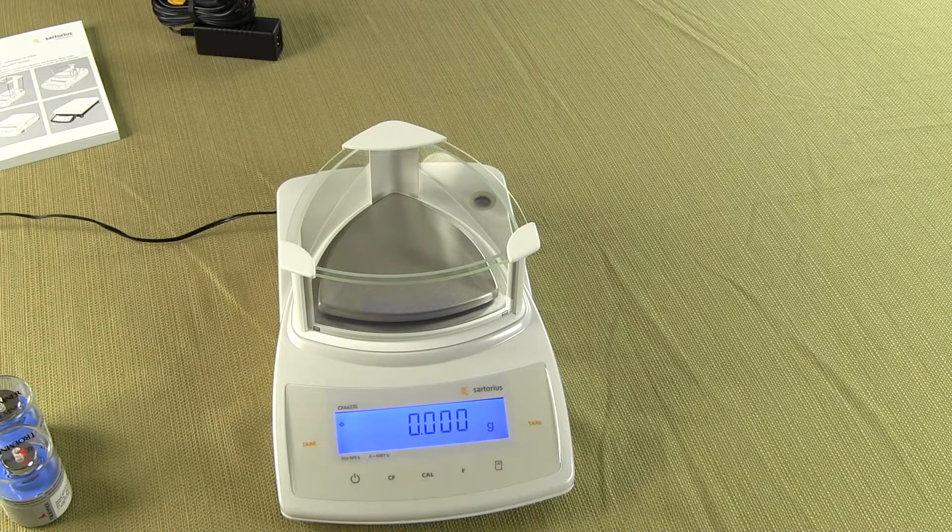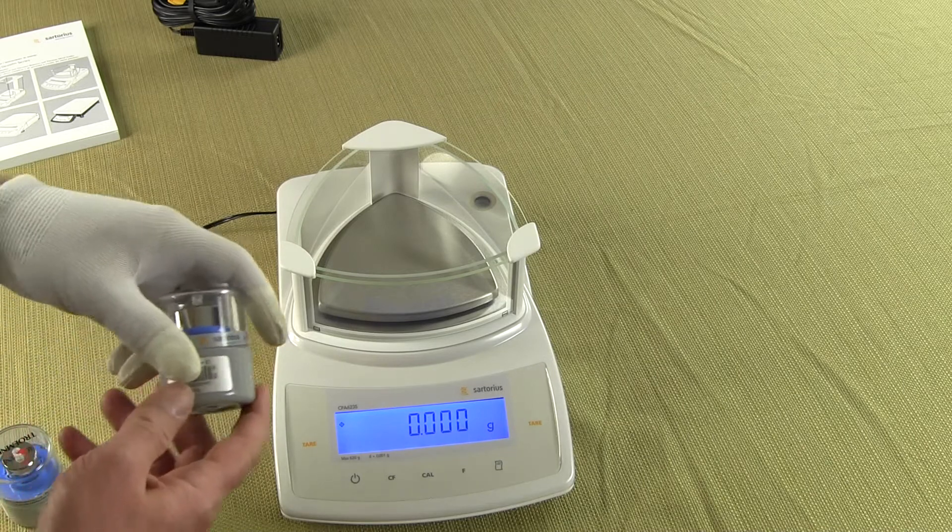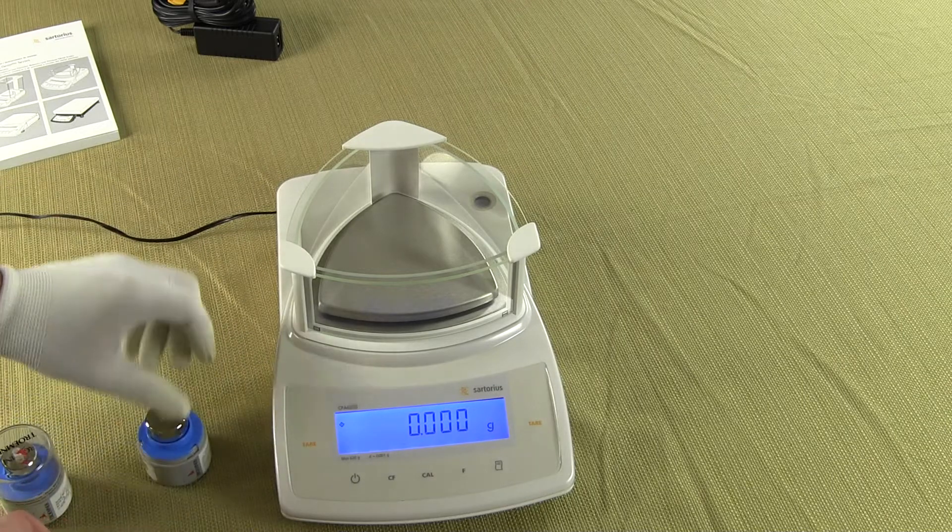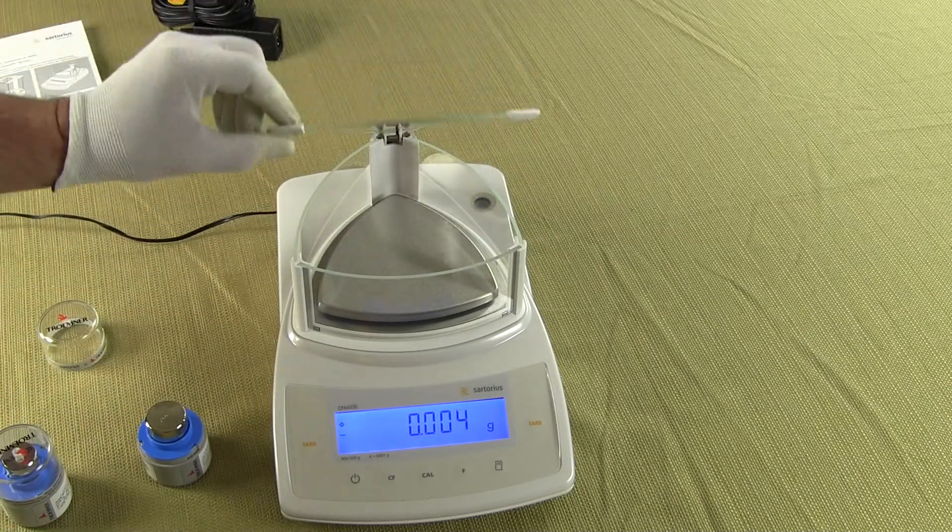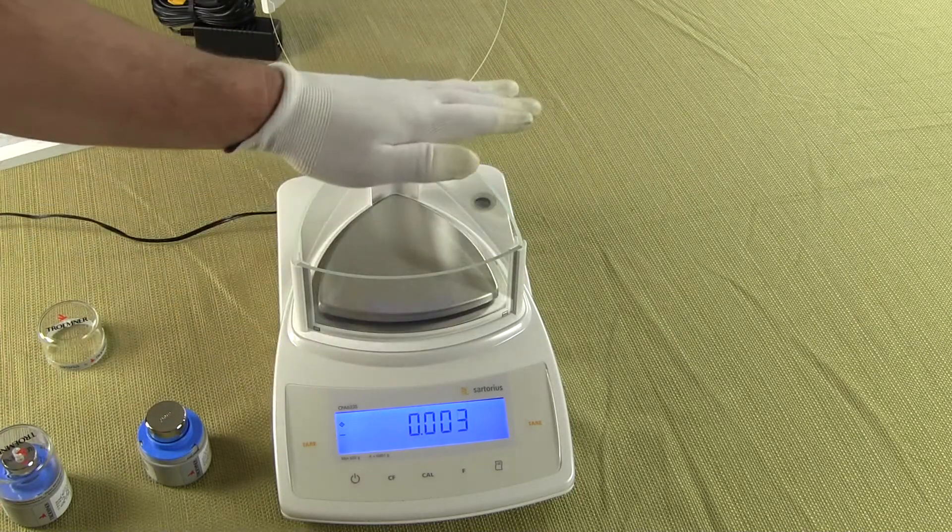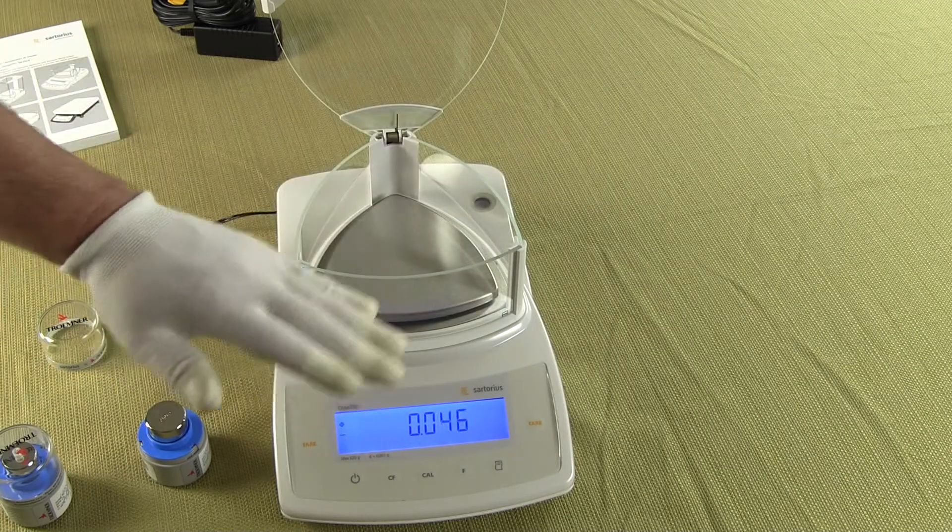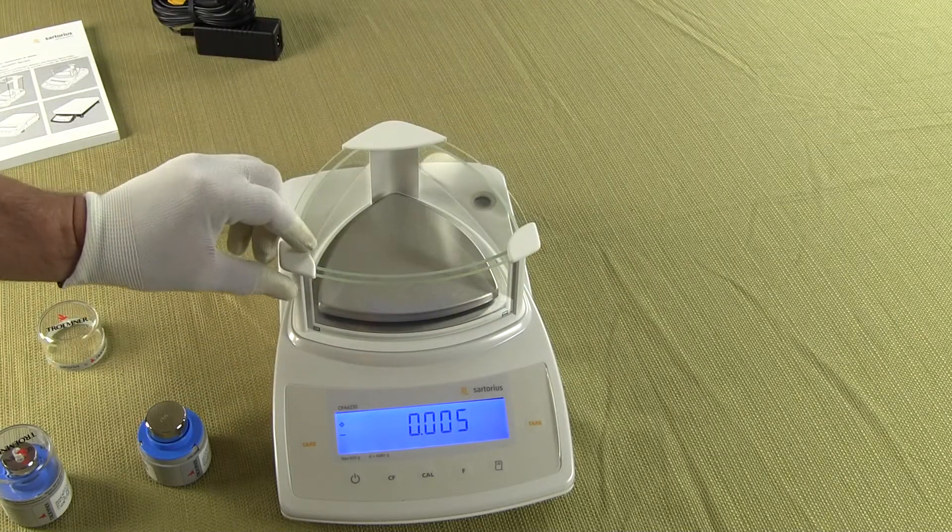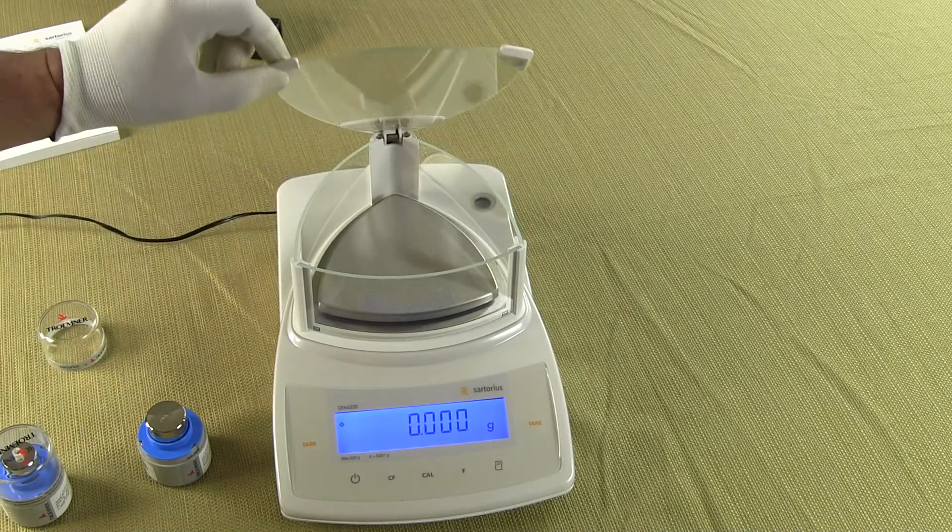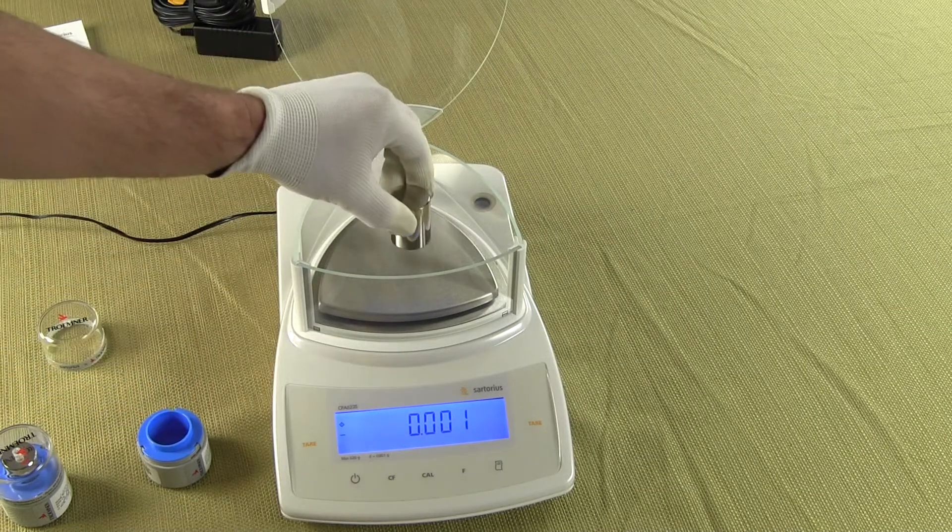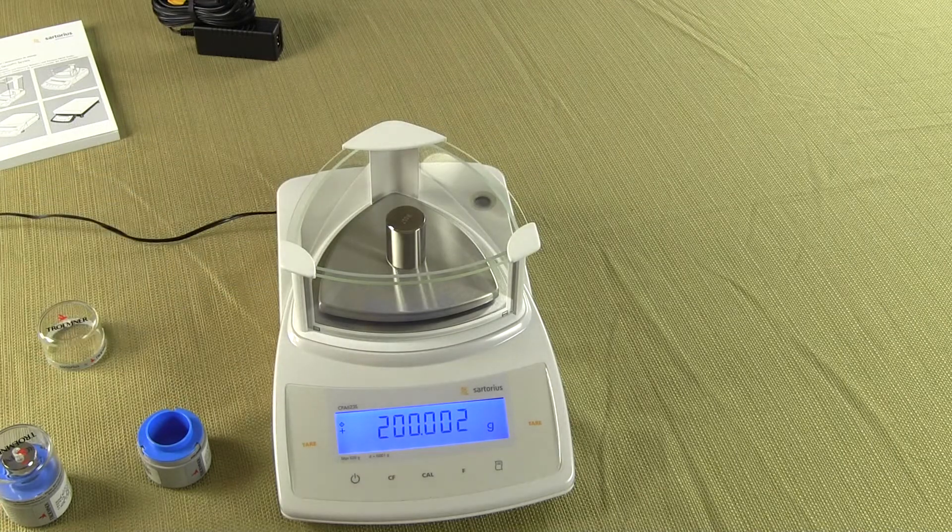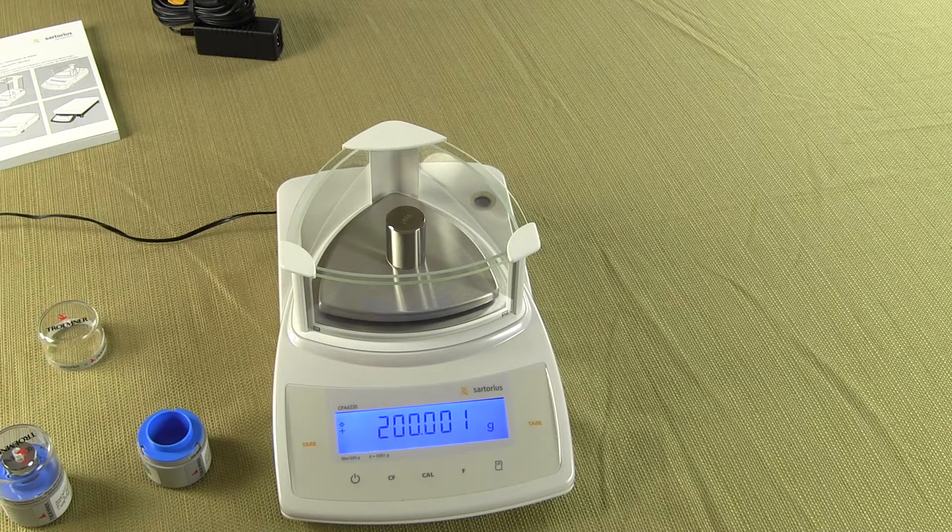So I have here my glove and we have here this is a class one 200 gram weight and simply open the draft shield. So this draft shield has a nice hinge, hinge cover and you can see this balance, if I move my hands over it the numbers go all over the place. This is why you really need a draft shield when you're dealing with a milligram balance. So the balance returns to zero. We open this guy up, put on a 200 gram weight and you can see the balance.